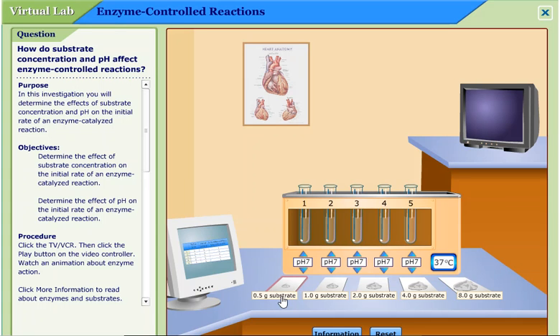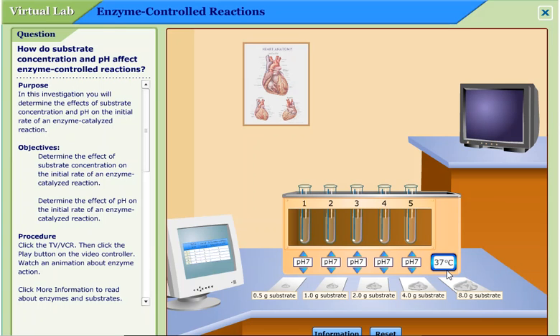If you remember anything at all about starch, you know it's a polysaccharide. Saccharide means sugar. So we're going to be breaking this polysaccharide down into monosaccharides or simple sugars called glucose. We're going to be looking at how many glucose molecules we get from 0.5 grams of substrate, 1.0, 2.0, 4.0, or 8.0 grams of substrate. We are not varying the temperature — 37 degrees Celsius represents body temperature, 98.6 degrees Fahrenheit. But we are going to be changing the pH as we go through. So let's do our first number.